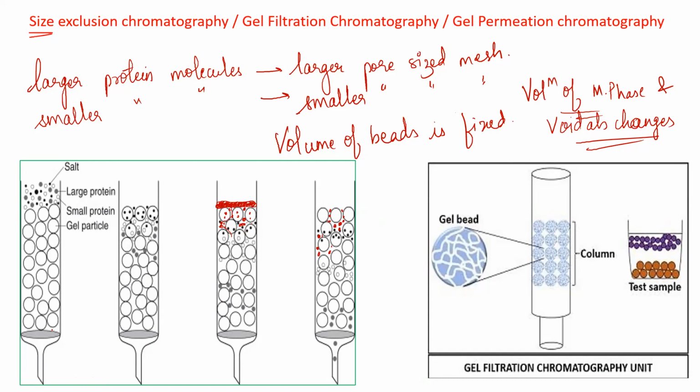Now the mesh within the bead is not straight. See, if you look at this particular bead here, how is the mesh? Is it just like straight?